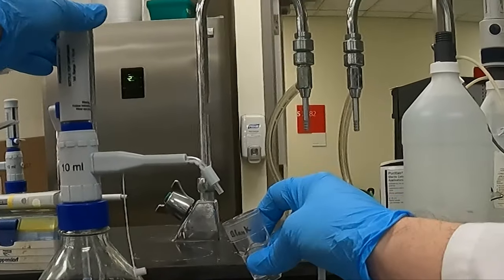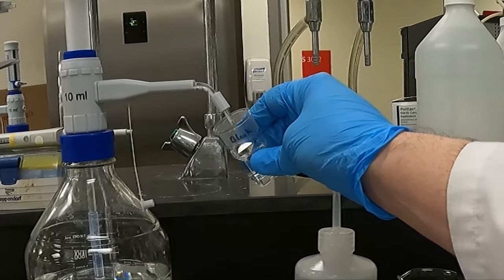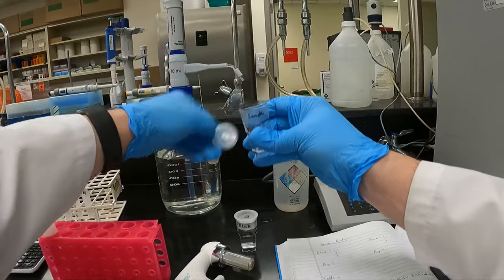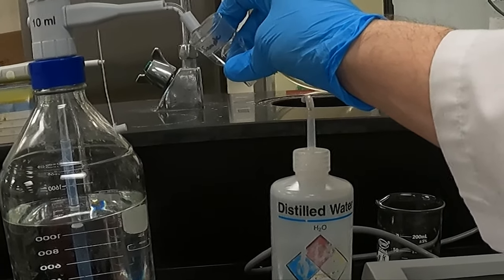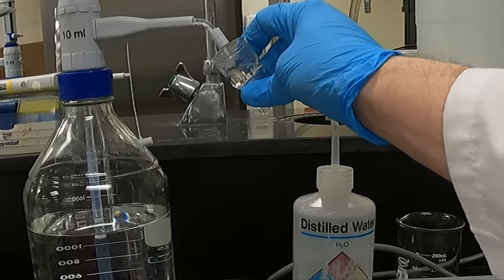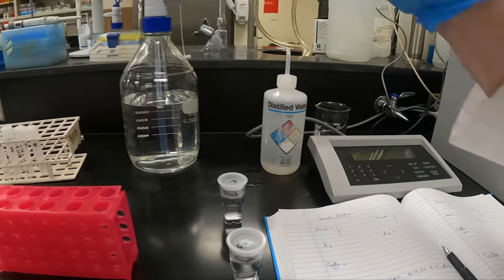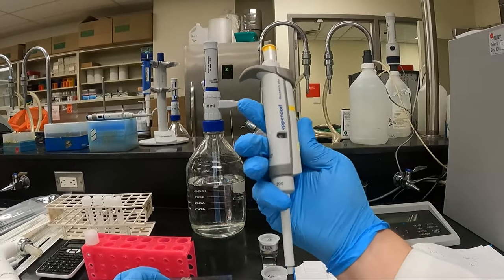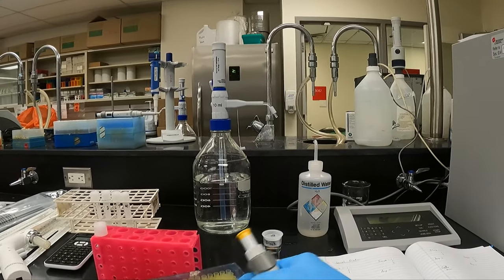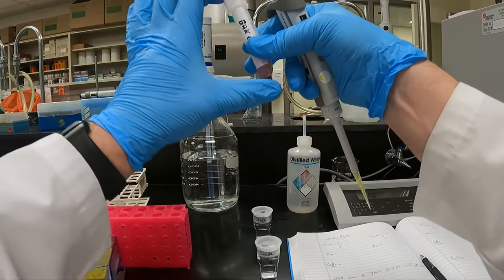Let's start by counting our cells using the Coulter counter. We'll prepare our blank and our sample by loading 20 mils of our isotone solution into each of the cups. When doing this, make sure you do not introduce bubbles, as the Coulter counter does not count cells, it counts particles. Any bubbles that go through will be counted as cells, and your reading will be off. I will now add 200 microliters of my sample of cells using a P200. As a result, my dilution factor will be 101 over 1.